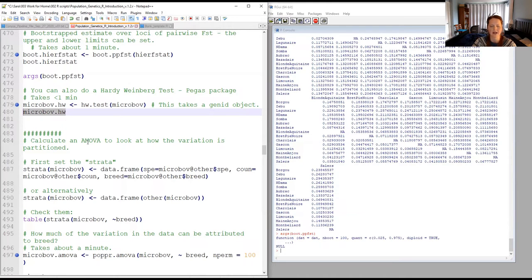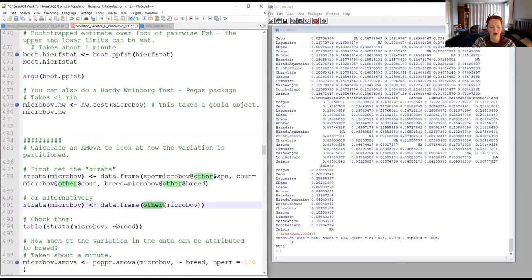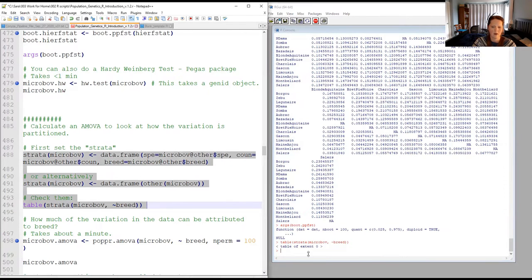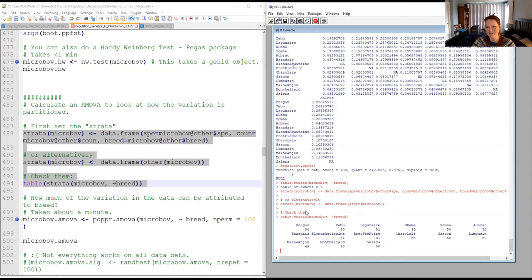Another thing most people will want to do is calculate an AMOVA to understand how variance is partitioned across their populations. The first step is to set the strata — the groupings. For our cows, we can set species, country, and breed as strata. You can then check sample size in your strata — here there are between 30 and 60 cows in each breed. Then you can use poppr to run amova(). It reports that about 12% of variation is between breed, with variation within breed and within samples. However, this doesn't give statistical significance — for that you'd need a randtest.